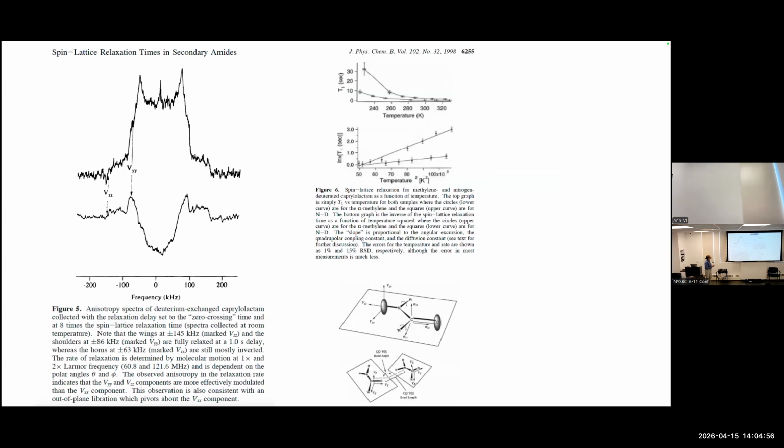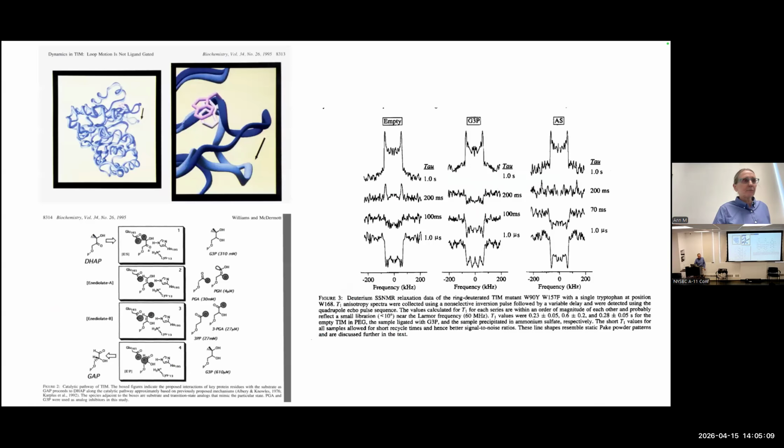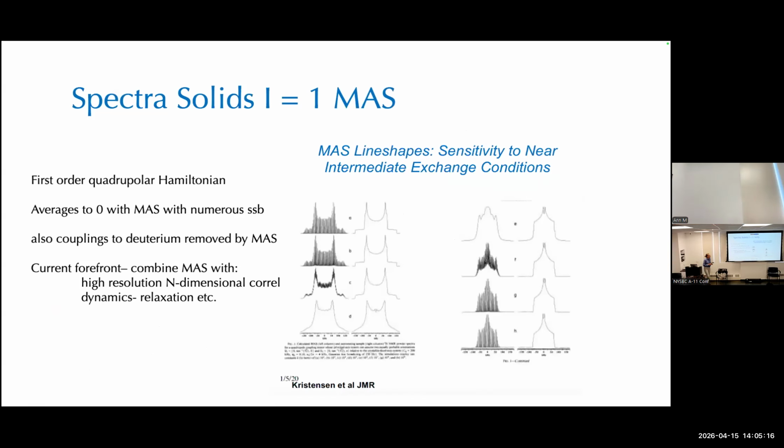T1 and T1 anisotropy, the turning or zero crossing points of some of these deuterium relaxation curves, give you lots of the anisotropic features, and experiments like that have even been applied to proteins. This is a loop of a glycolytic enzyme. And the last thing I'm going to show you just as a phenomenology here is that because it's so much like the CSA and the dipole coupling, it was expected that it would respond the same way to MAS on this theory.